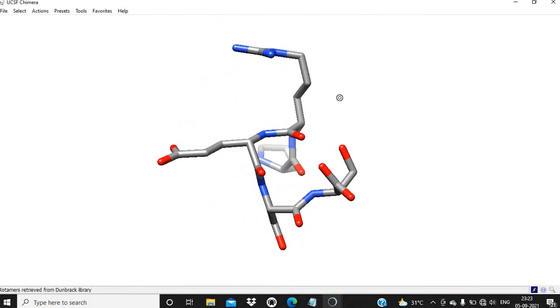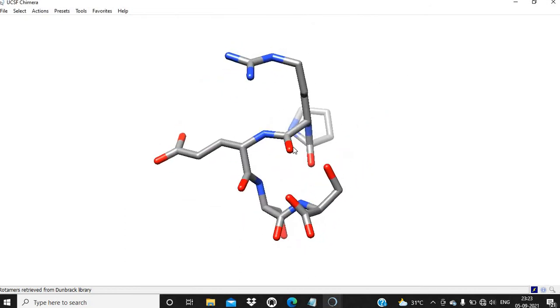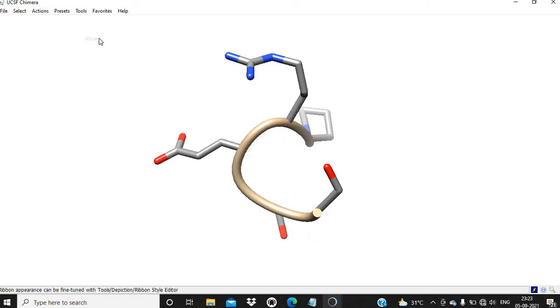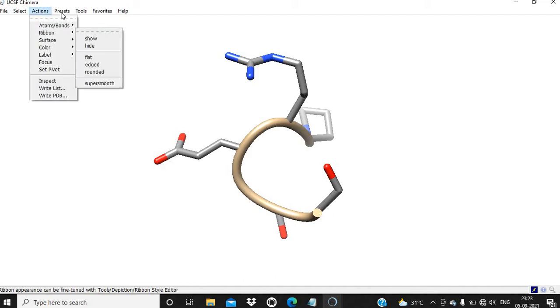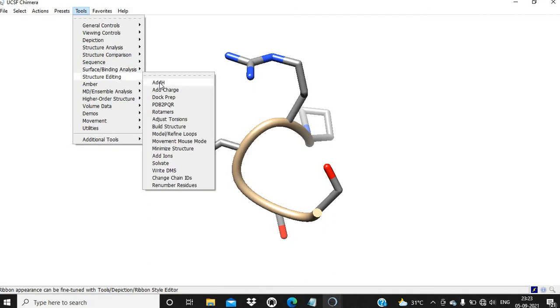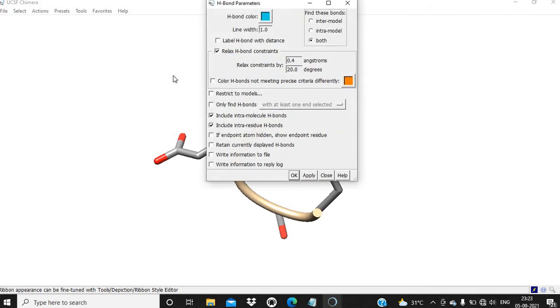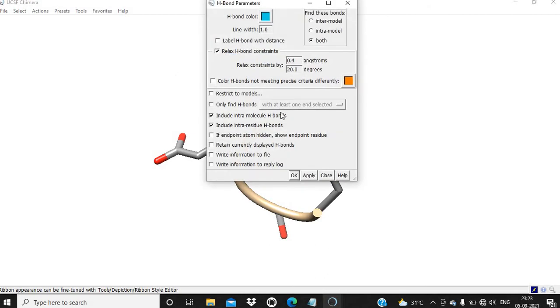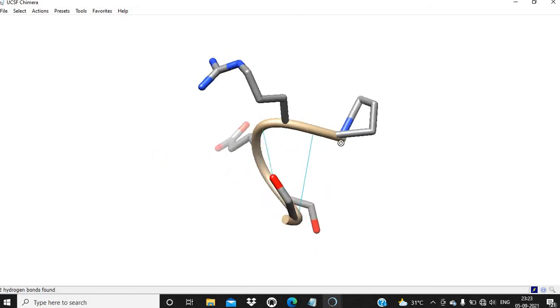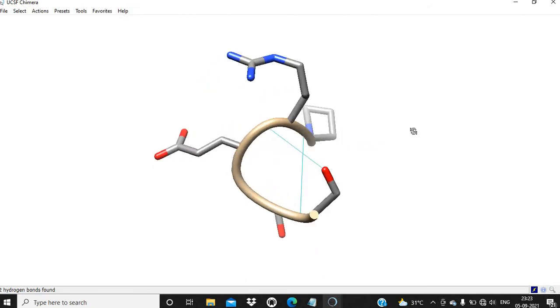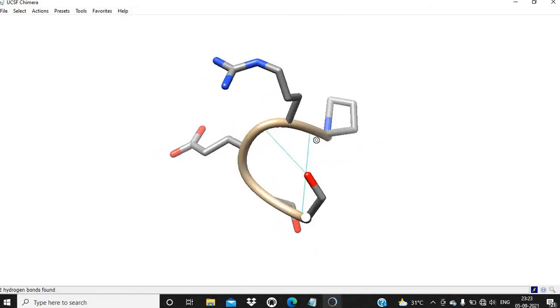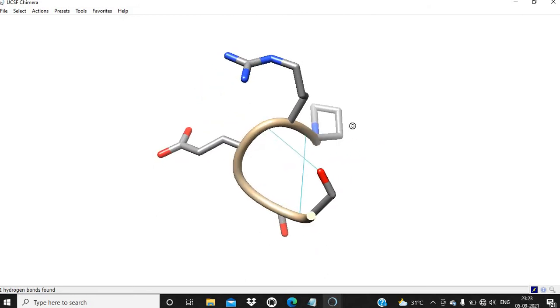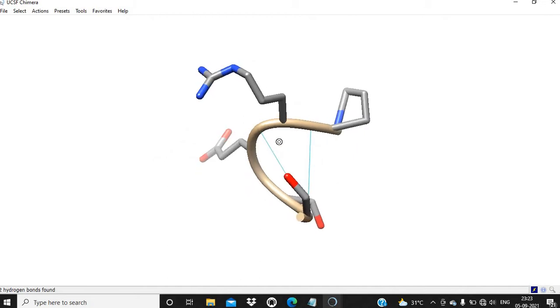We can change the representation of this peptide to ribbon. We can also visualize the hydrogen bonds. For this, Surface Binding Analysis, Find H Bond. Here are two hydrogen bonds present.